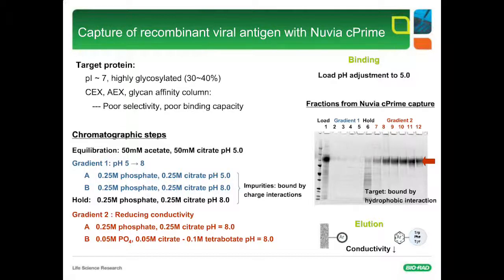Although we know pKa is about equilibrium, you always have a portion of the ligands that are negatively charged, but the majority at this pH will be neutral. So it's a combination, like one of the cases I showed you, of hydrophobic interaction as well as weak cation exchange interaction. I see, because now we're operating around the pKa, so you're basically operating in the hydrophobic domain. Yes. And as you go up from there, you flip the charge on the ligand to cause that repulsion. I hope we've answered that question.